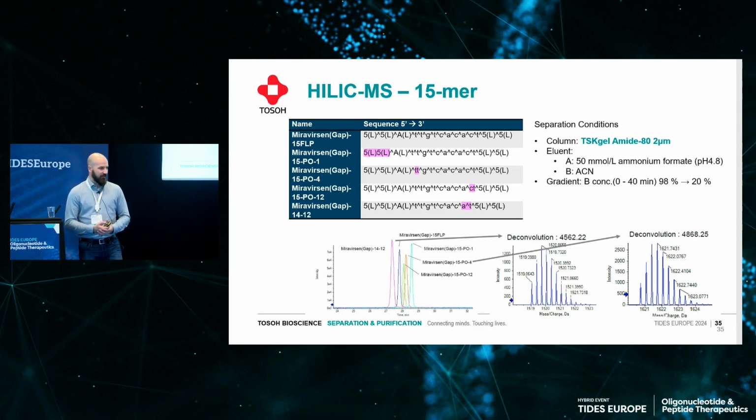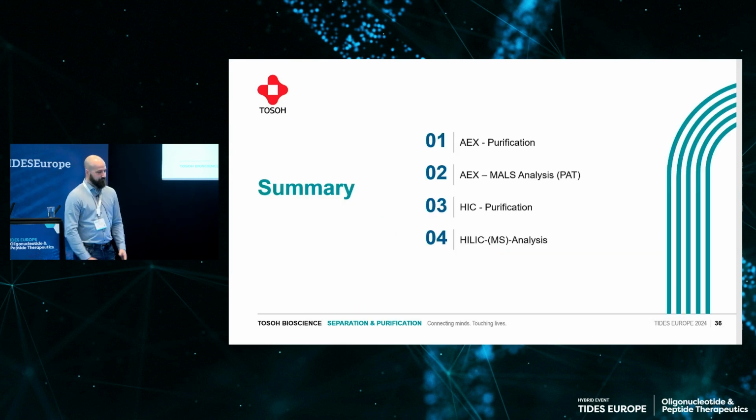So that might also be a nice idea to complement what you're already doing in your analytical portfolio. So instead of just doing anion exchange and an IPRP mass spec, maybe an idea to also investigate hydrophilic interaction chromatography a little bit.